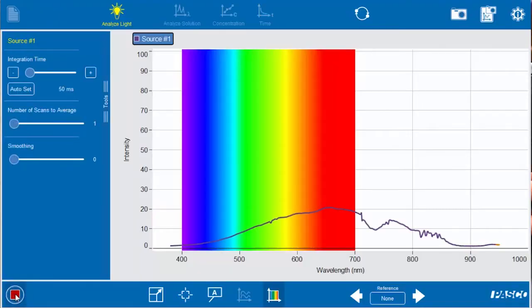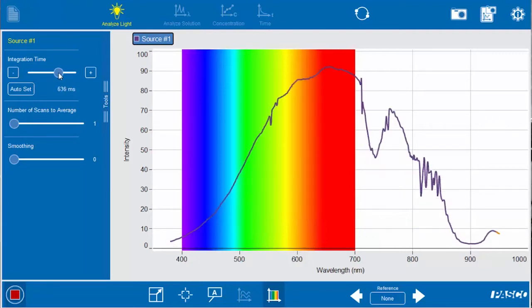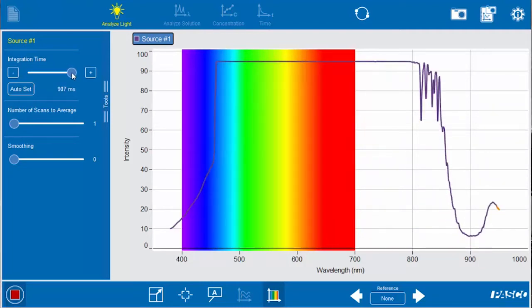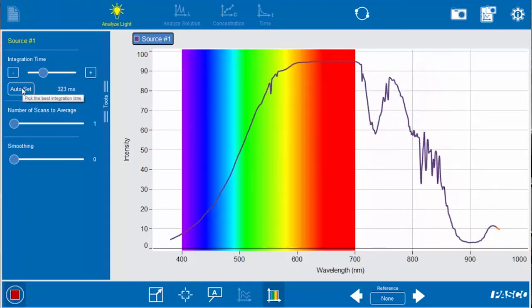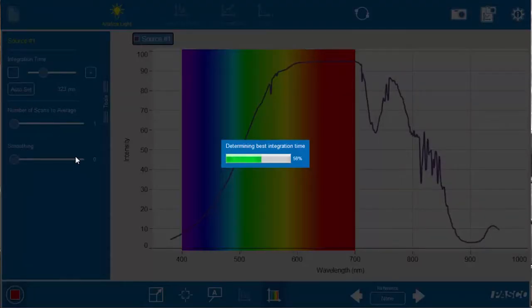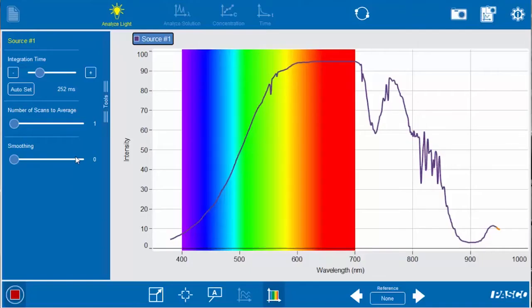When we're ready to record data, we press in the bottom left-hand corner the play button. You have a choice to either set the integration time manually—the higher the integration time, the more light it lets in, it's almost like the shutter speed on a camera—but in general you will press this button auto set and it's going to determine the best integration time for our given light source.